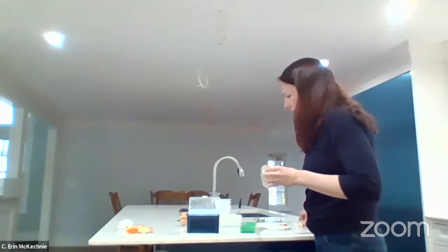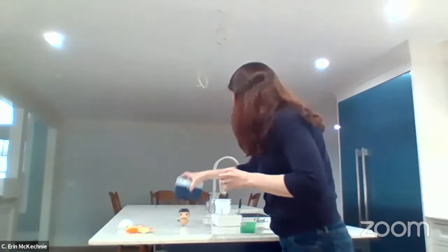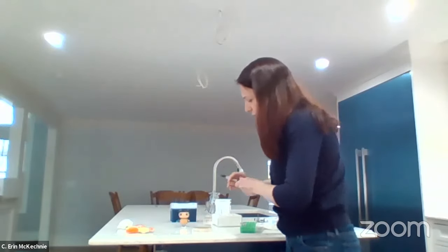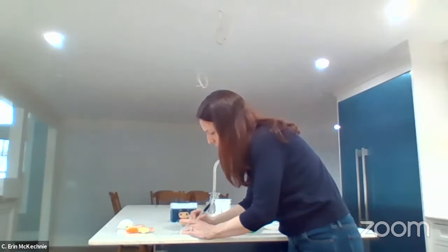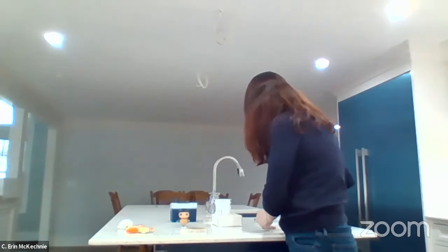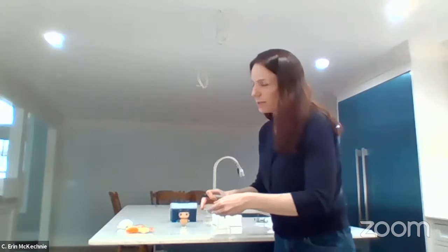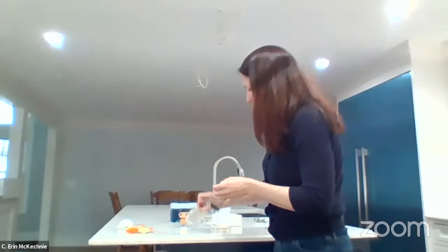Okay. So these just are Petri dishes with food in them for bacteria, and that's it. I'm going to label my Petri dishes with a permanent marker, and I'm going to draw a line down the center of each dish. And the reason that I'm doing that is ultimately I want to add a little antibiotic, a little ampicillin to one side and a little kanamycin to the other side. So that's just helping me keep organized.